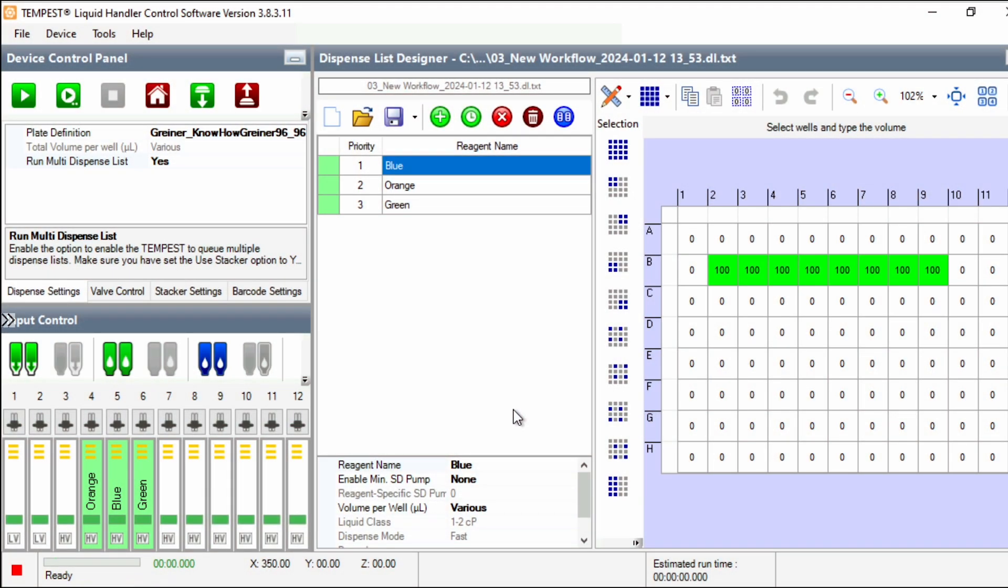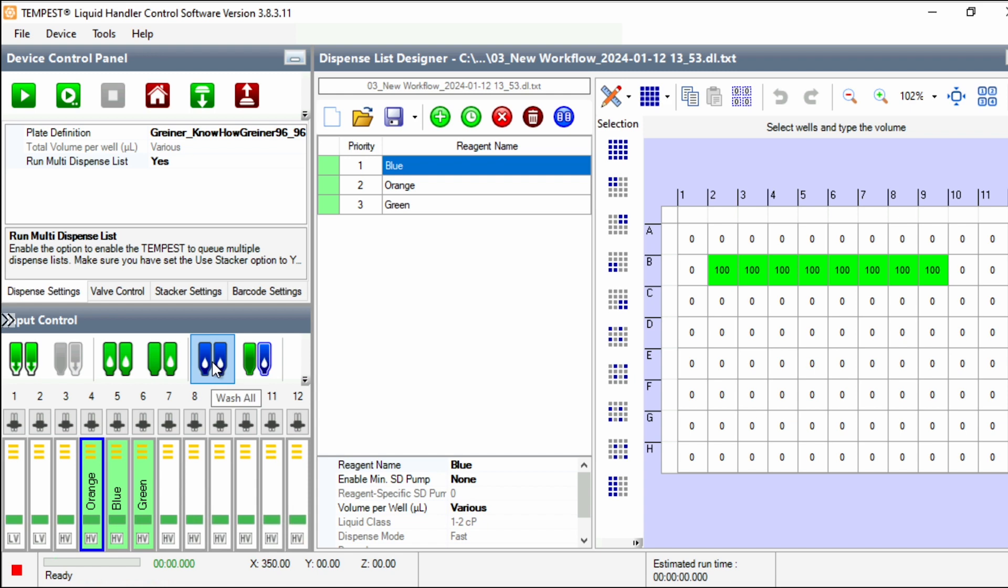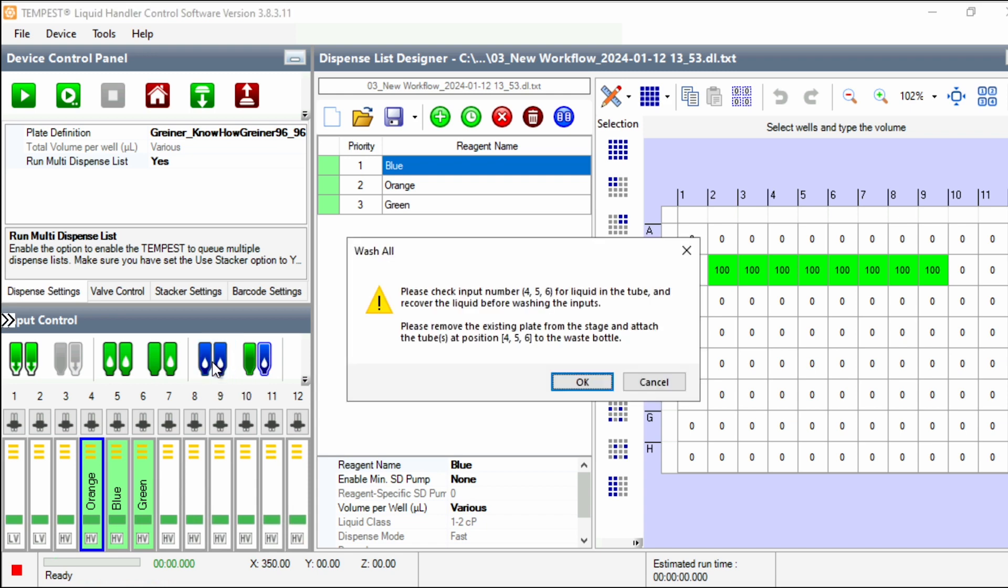When your execution is finished, you'll want to wash the chips to clean them. To wash one chip, select it and click Wash Input. And to wash all the chips, click Wash All.